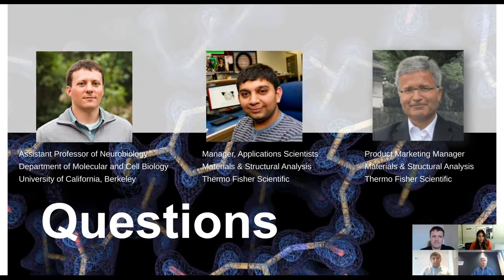Okay, thanks. So you started talking about the hardware. I'll switch there for this question. Will the E-CFEG also be available for retrofit possibilities on existing Krios microscopes? Mark? Yes, Leah, this is indeed the case. So if you have a Krios of the generation G3 or G3i, and you upgrade the instrument to Windows 10, then you can indeed have the CFEG retrofitted onto those instruments. And of course, in addition to that, the Krios G4 can always be equipped also as a retrofit later on in the field if you decide to add on a CFEG later on.